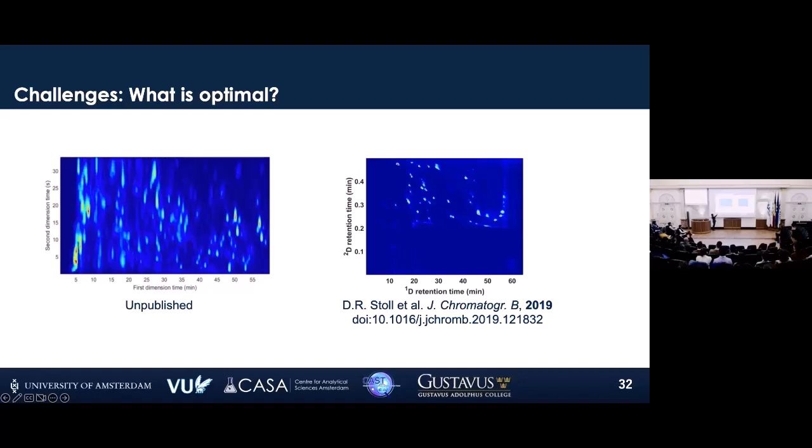And of course, this looks maybe good in terms of coverage, so the peaks are all over the place, but they're extremely broad, co-eluting all over. Whereas here, these are maybe not using the entire separation space, but you can fit a lot of them on there. But right here we go again. What do I tell the algorithm? Maximize the peak capacity. And then Hans-Gert will barge in and say, I don't care about peak capacity and orthogonality. I just want these 5 analytes to be separated from the rest. So this is the other thing where we're really bashing our heads against the wall all the time.